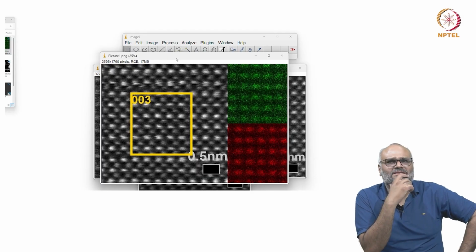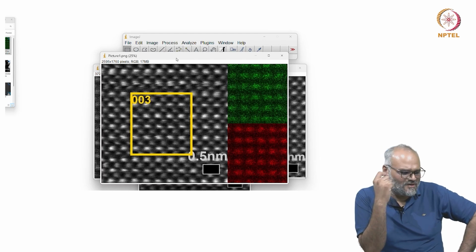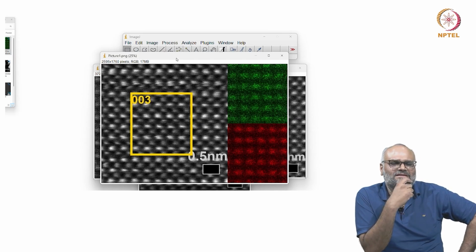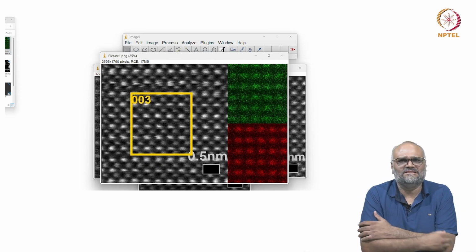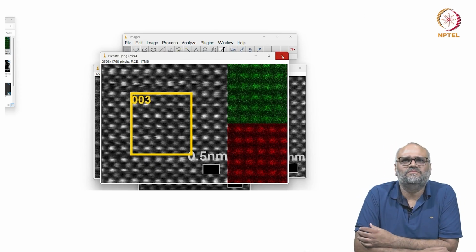Now you might wonder, is this actually acceptable? Well, if you're not that particular and not that concerned, people do this, but it doesn't look very elegant. So there are better ways to present this. Let us understand how.